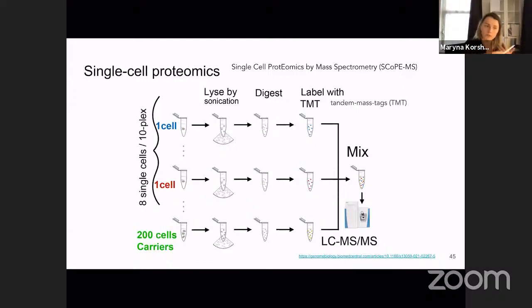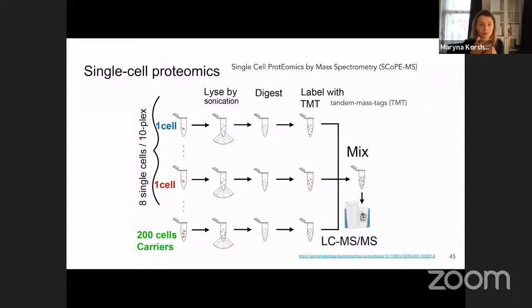But if you would like to have a real high throughput method, mass spectrometry is much more suitable for these needs, because in a mass spectrometry result, you have different peaks of the relationship between mass and charge of different molecules or parts of molecules, based on which, and using different databases, you may say that this particular protein is abundant or very intensively presented in this data set.